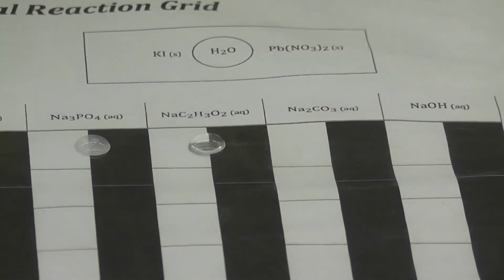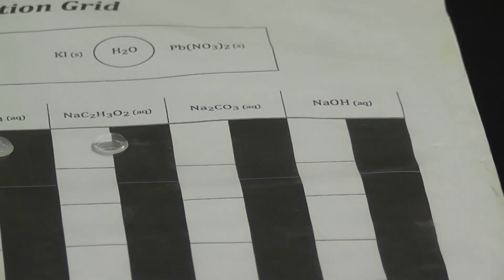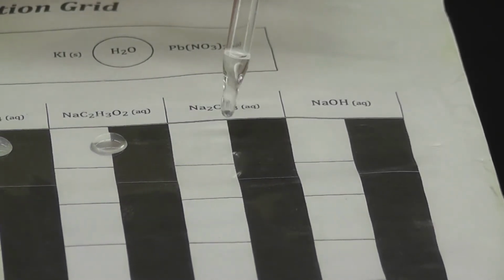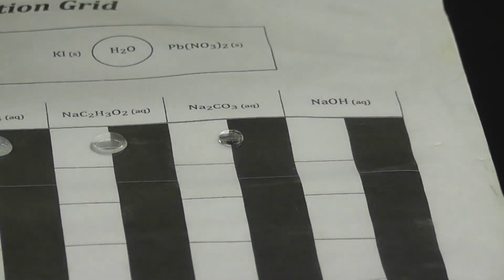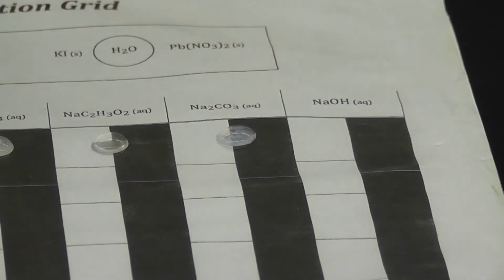Okay. 2 more left with the lead-2 nitrate. And you want to be really careful that you don't mix things because it could change your results, so be very careful. So I'm putting 1 drop of the lead-2 nitrate in this grid. Okay. So now we're doing sodium carbonate mixed with that. So 1 drop of sodium carbonate and observe. Ooh.